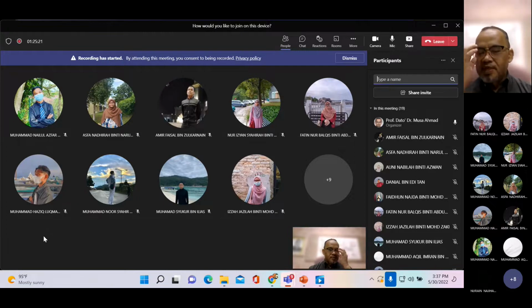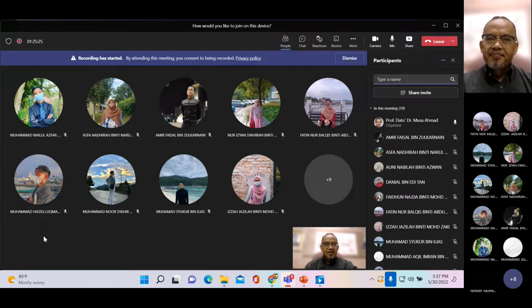Jadi yang menyerap ni biasanya adalah yang boleh memberikan respon dalam julat UV dan visible, iaitu mereka yang boleh menyerap cahaya atau foton dalam julat UV dan visible.